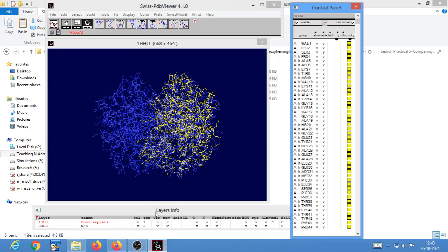Okay, so now I think you have noticed the effect on the file list menu at the top of this control panel. Each time you press tab, Deep View makes changes to the active layer. So each time you press tab, the active layer would change.